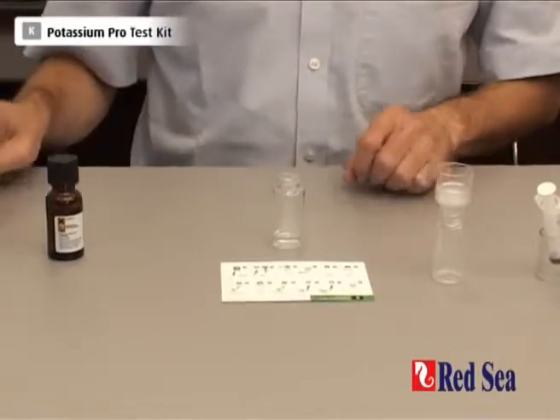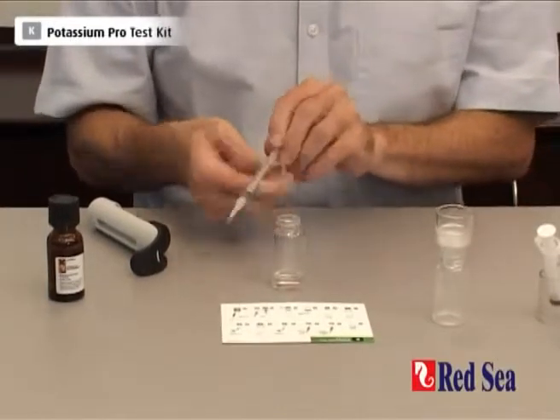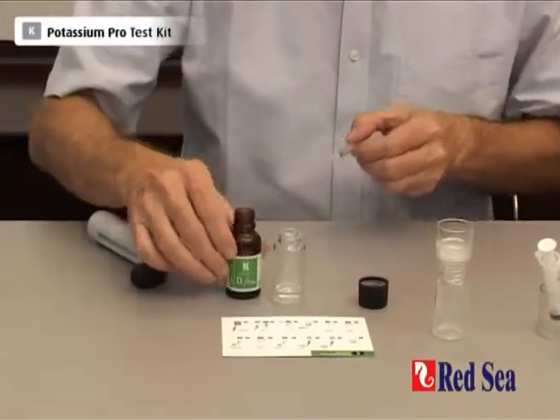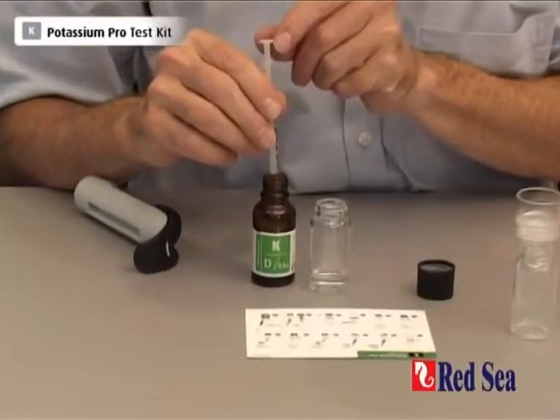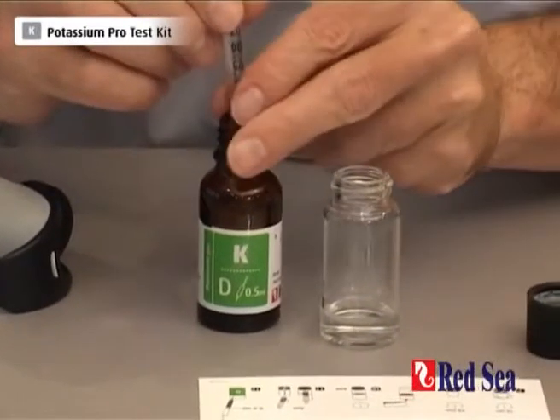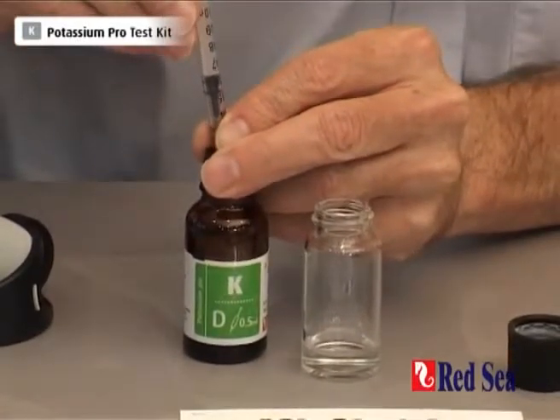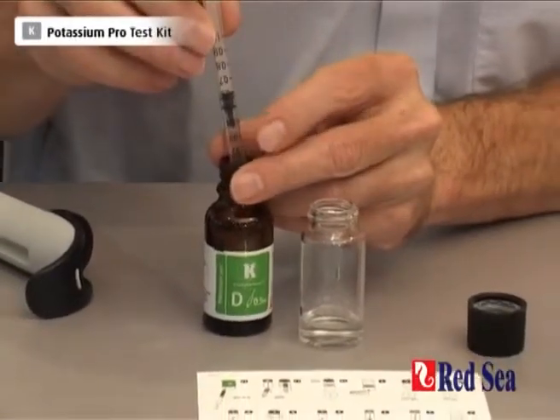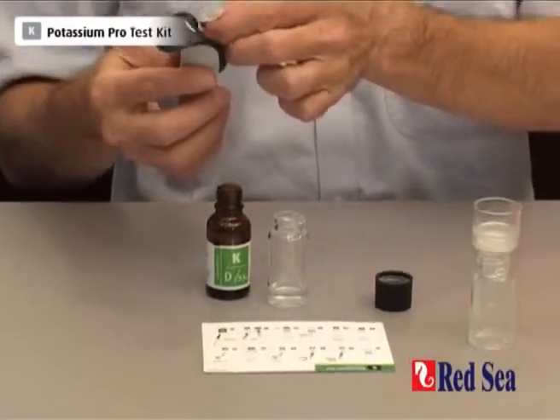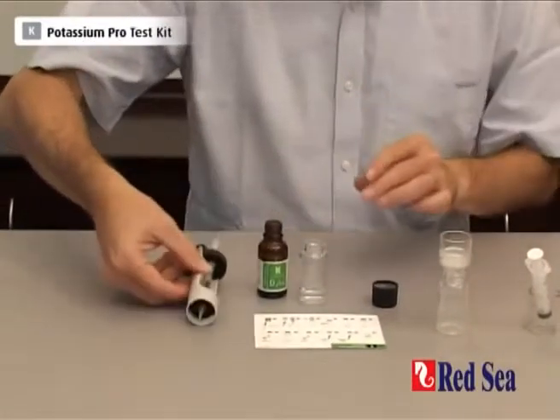The next thing we have to do is get our titrant ready. We take our titration syringe and take exactly 0.5ml of titrant into the syringe. Remember to keep the tip in the liquid at all times. We're measuring the 0.5ml with the bottom of the plunger — and there we have the plunger at 0.5. Let's put the syringe into the titrator and set it aside until we're ready to use it.